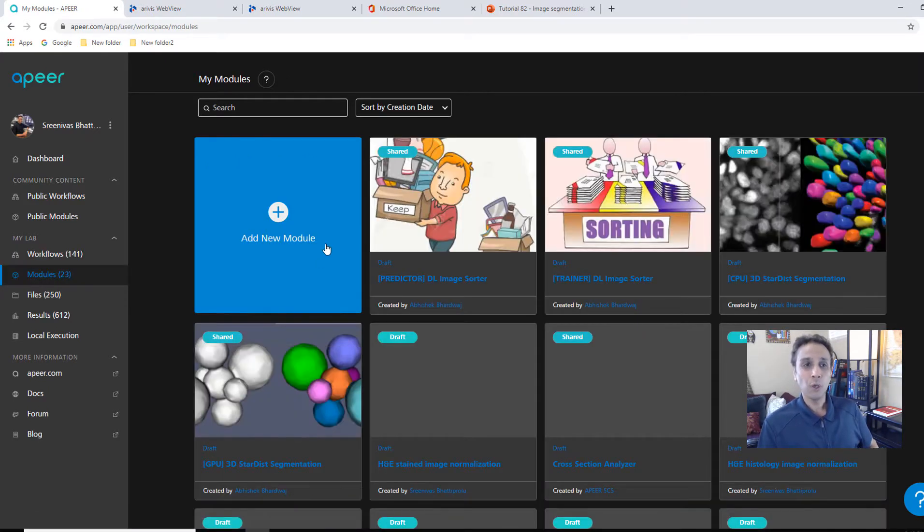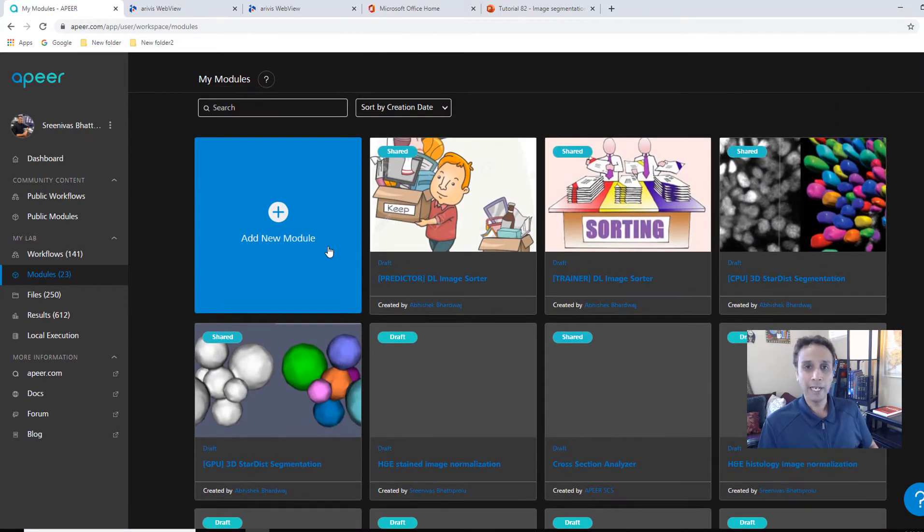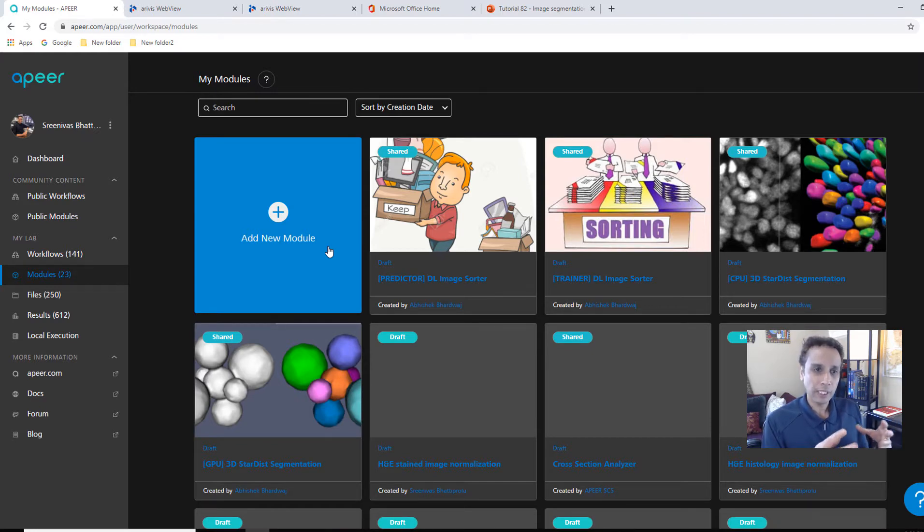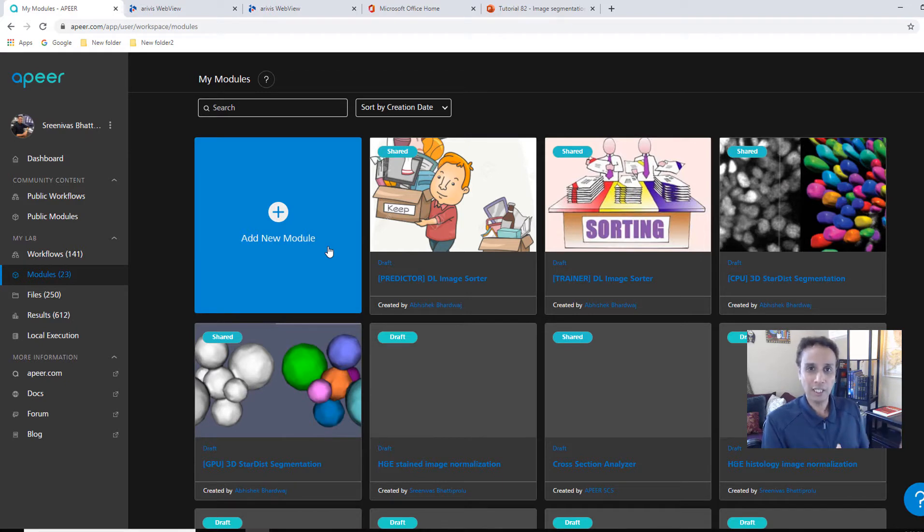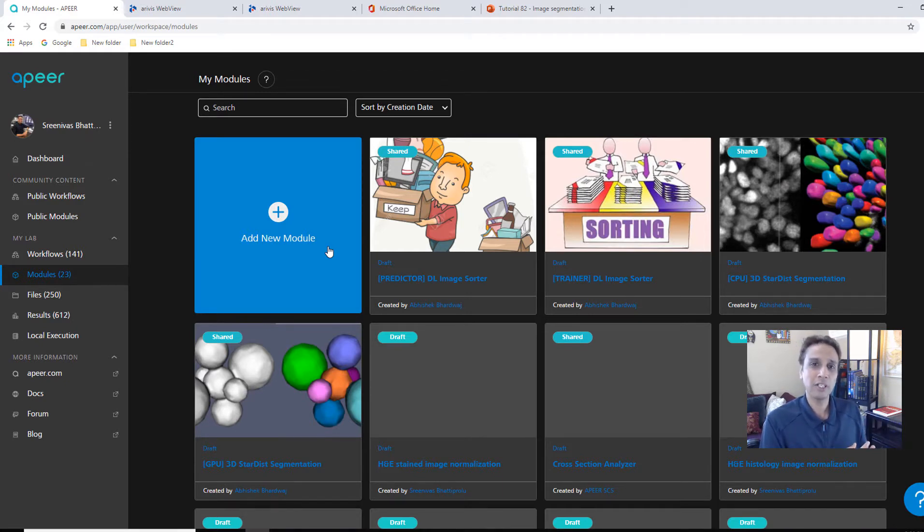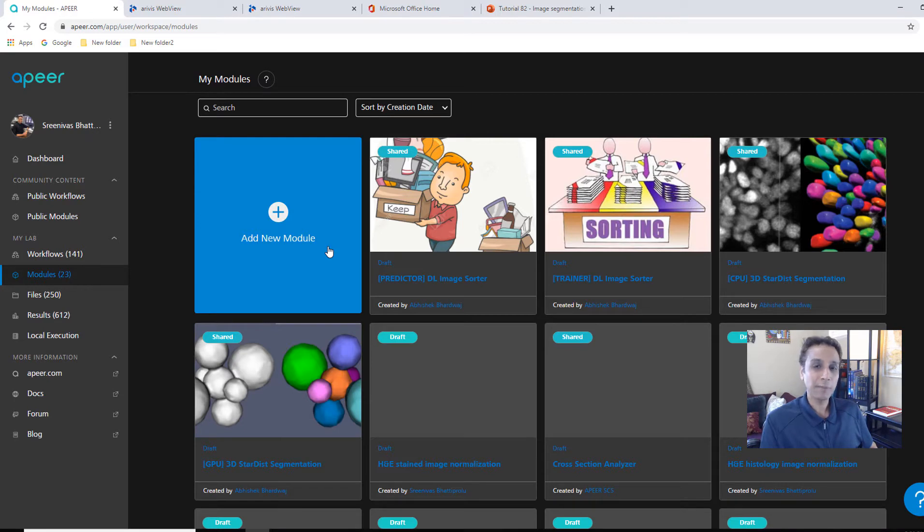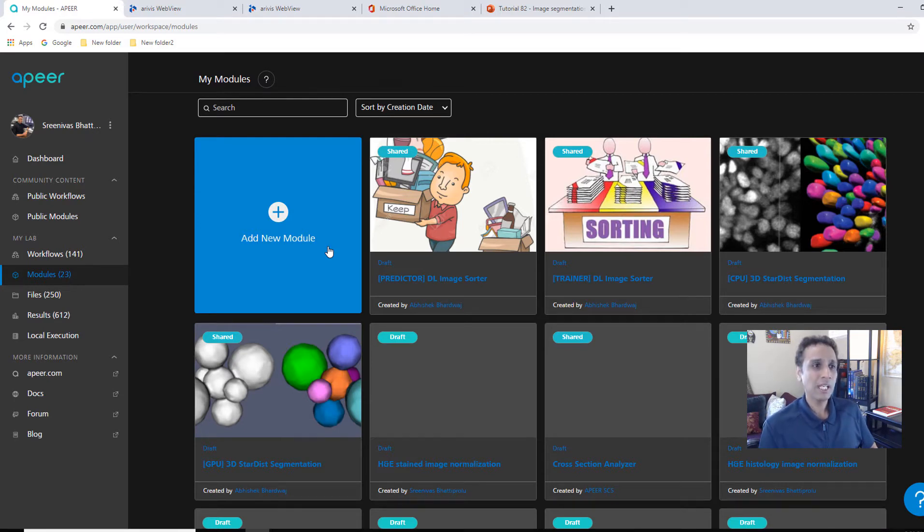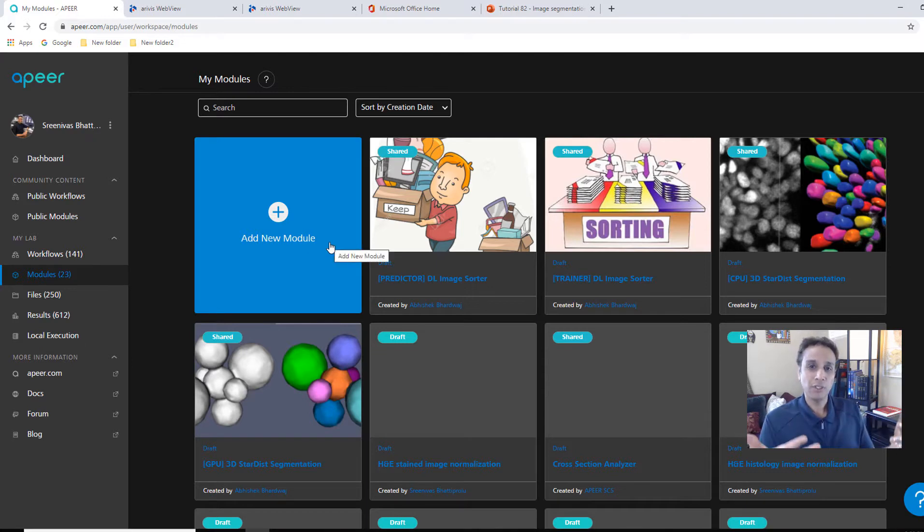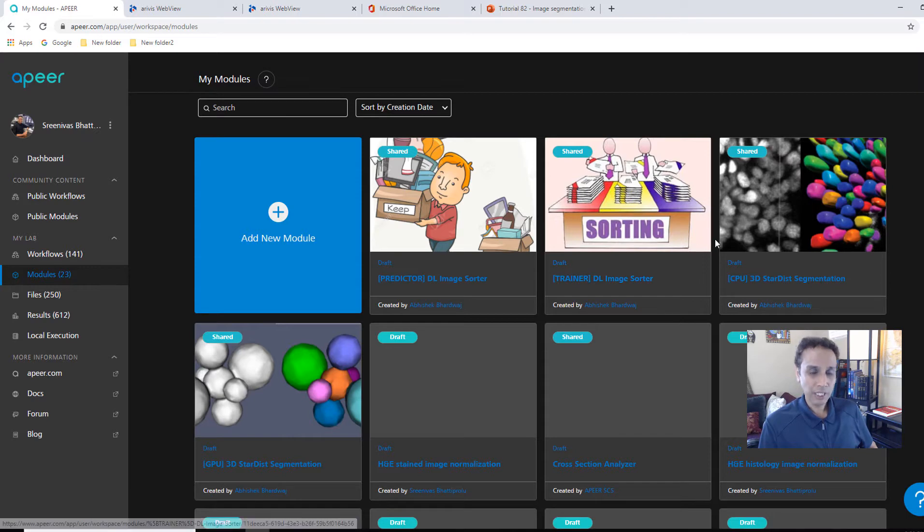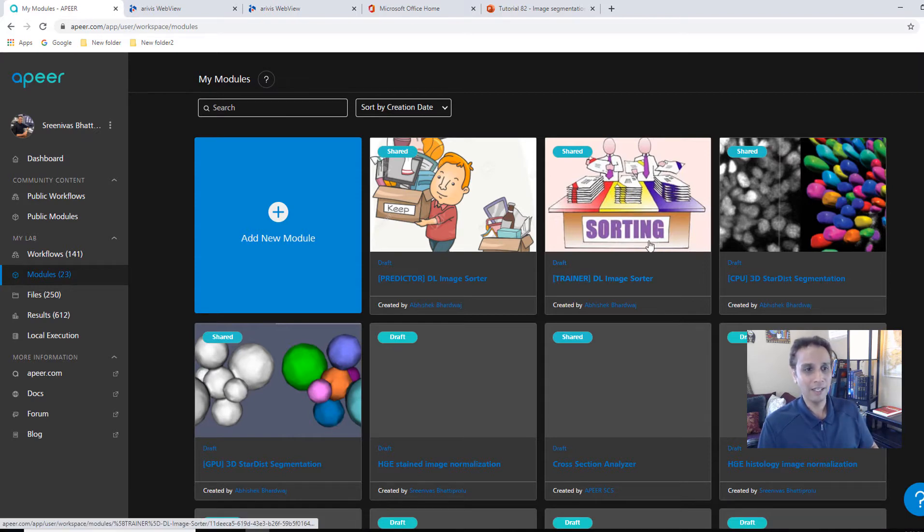My modules, if you know how to code, hopefully you probably know how to code by now a little bit, then you can easily put together a module. A module is a Docker container. Again, please look it up. And of course, in this channel, in the APEER channel, we have videos on how to create your own module. So please look at that and create it. If you know a little bit of coding, you can do that. And you can create a module out of most scripting languages, Python, Java, image J scripting, or any of those.